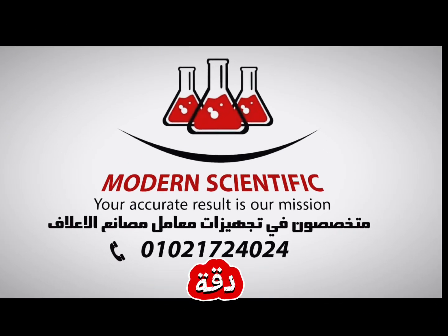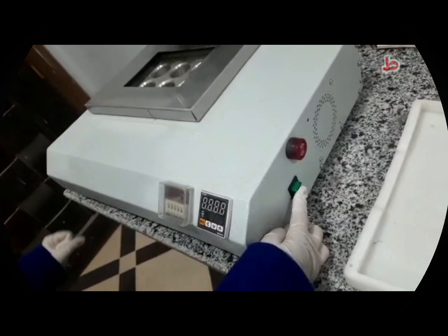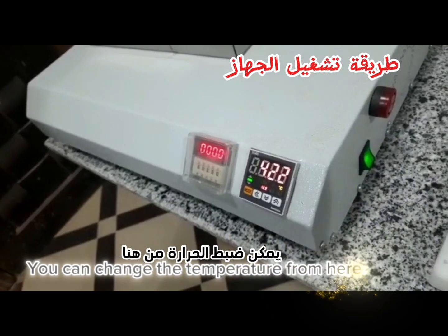Modern Scientific — the quality of your results is our goal. Protein Analysis: First Step — Digestion. Turn on the device by pressing the power button. You can change the temperature from here.